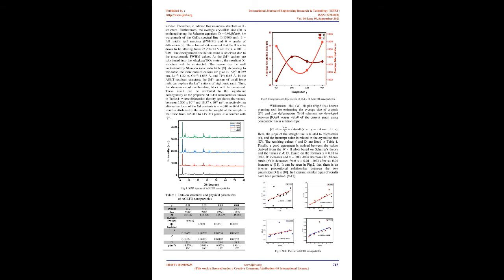Accordingly, the AGLTO nanoparticles went through different characterizations, for instance, X-ray diffractometer, XRD, Bruker, Cu K-alpha equals 0.15406 nm, FTIR spectrophotometer, IRAffinity-1, Shimadzu, and UV-visible spectrophotometer, JASCO, V670 PC, to study the structural and optical properties, respectively. XRD Analysis.